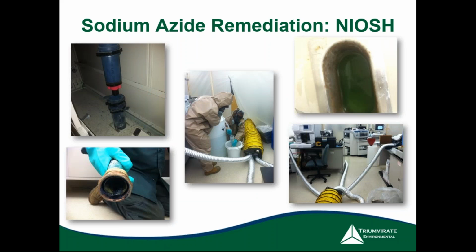So here's just a few more photos. Again, isolation of the system shown on the left. Introduce 10% sodium hydroxide to the system. Allow that 16 hours, soak, rinse, do the nitrous acid for 24 hours, venting the whole time, monitoring for gases, then another rinse followed by removal.